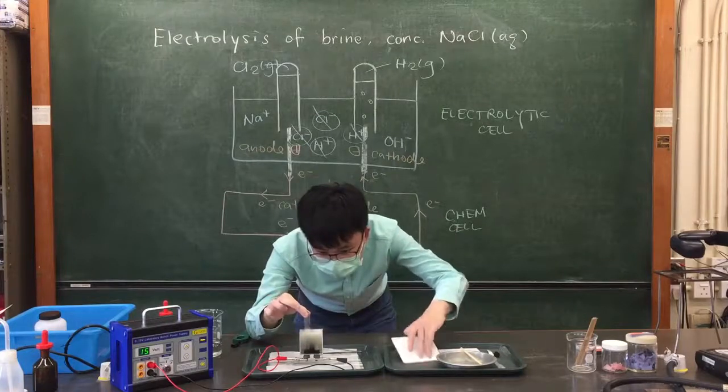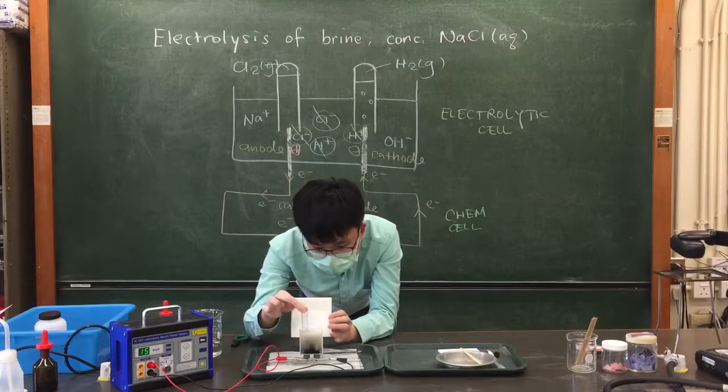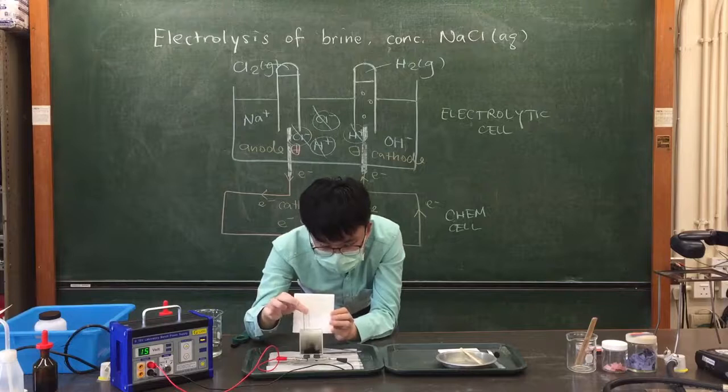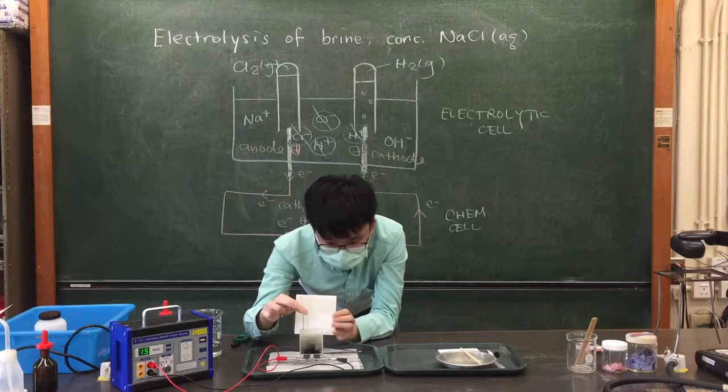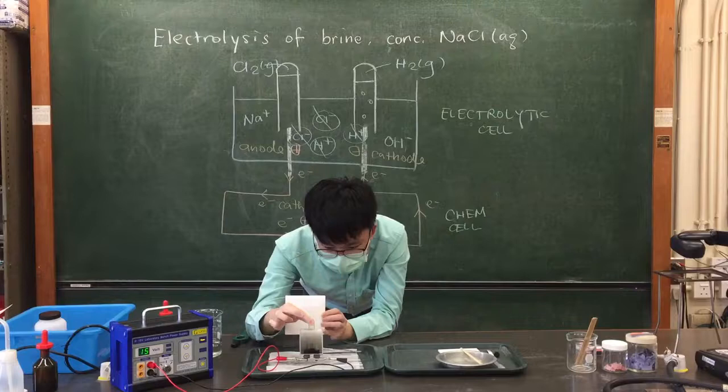And of course, can you see the color of the gas here collected? And I start smelling a swimming pool smell, okay? The chlorine smell already, huh? Can you see the yellowish green color formed in the test tube? The kind of gas, although it's very pale, okay, pale yellow. Okay, yellowish green, this kind of gas. Great! How about I now collect the gas?